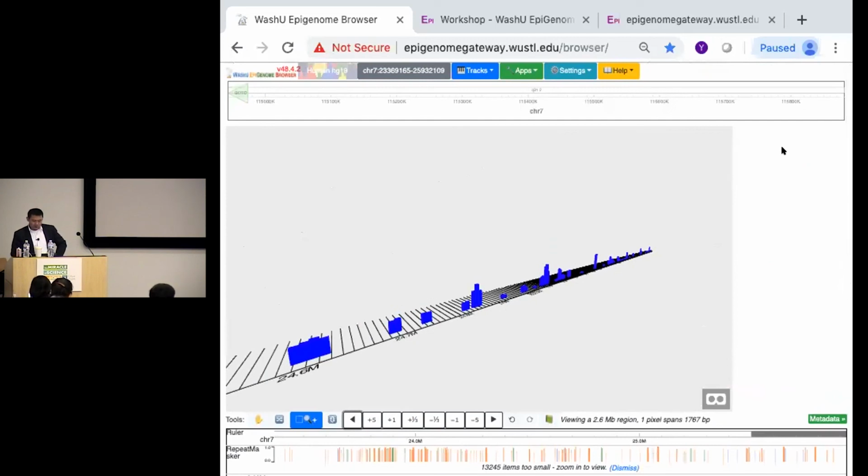This one is still computationally more intensive than I want, so we continue working on this. But hopefully you'll see we're having lots of fun. We're working hard to make this more useful, but at the same time, we really enjoy doing this. I might have skipped some stuff, but I think this is pretty much everything I've prepared.